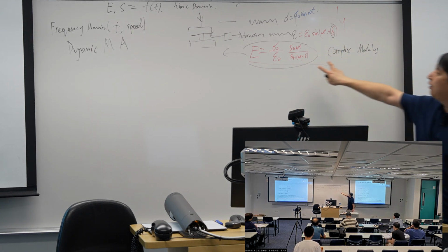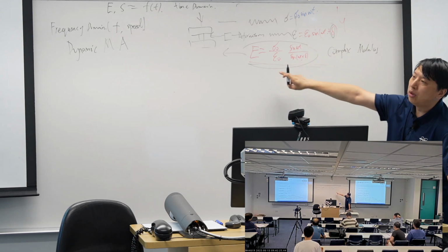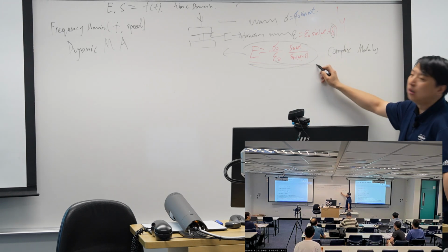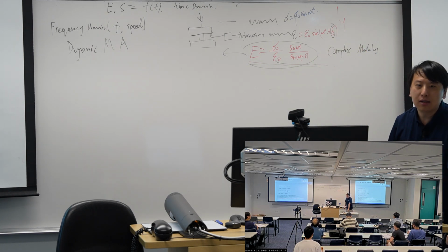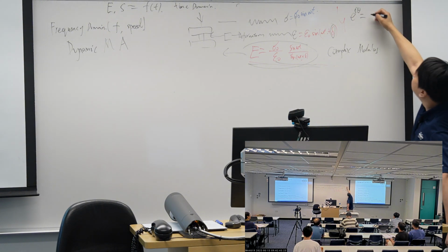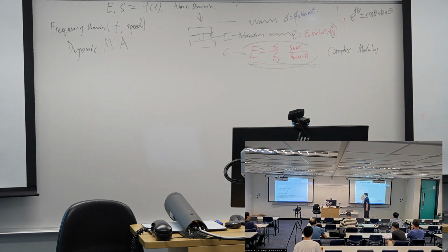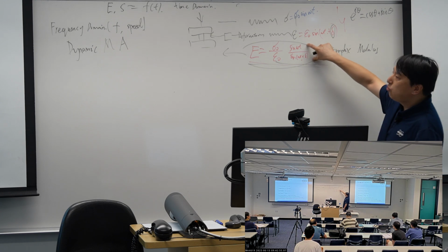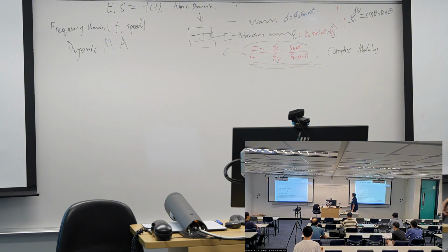Because from our experiment, we get our effective modulus like this, and we cannot get rid of the time easily. So we decided to change the sine wave back to the exponential using Euler's formula. We can just use the Euler equation to replace these sines with the exponential, and then we can easily get rid of time.